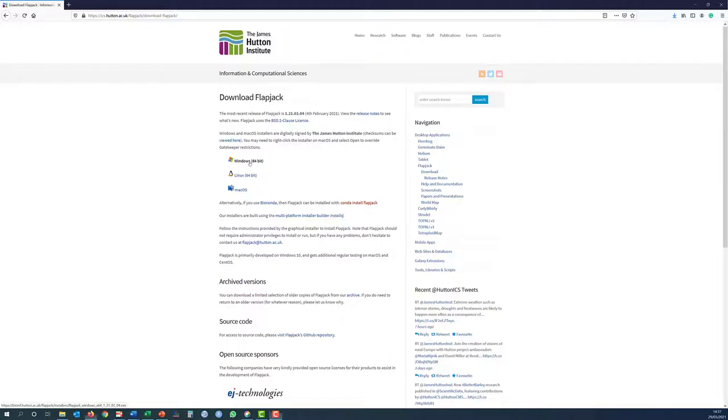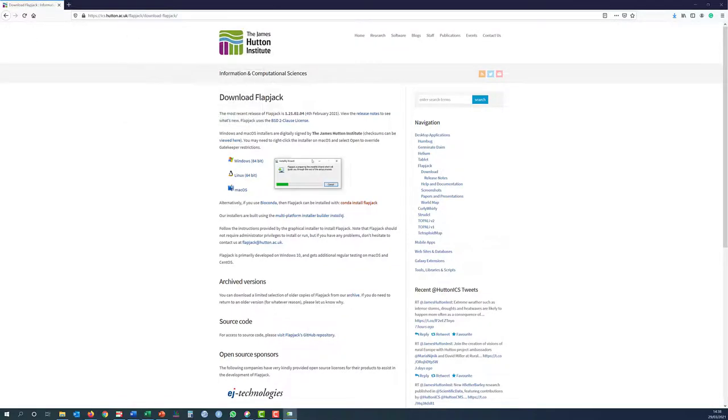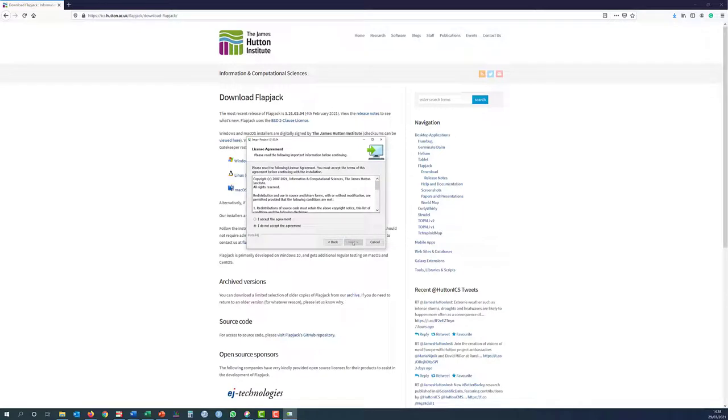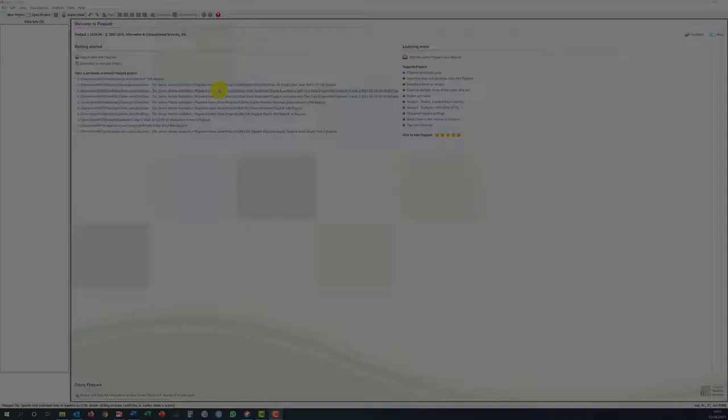Follow the instructions provided by the graphical installer to install Flapjack. Note that Flapjack should not require administrator privileges to install or run.